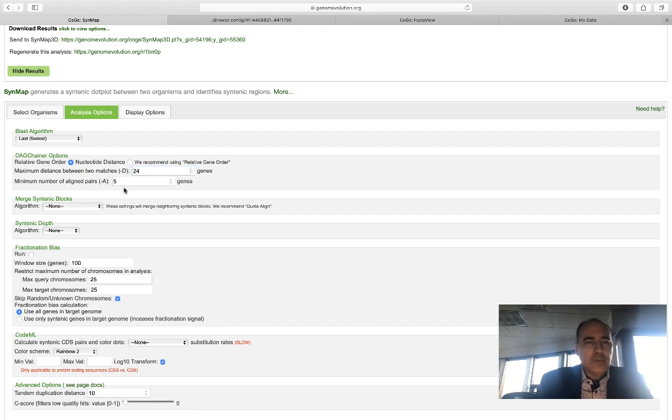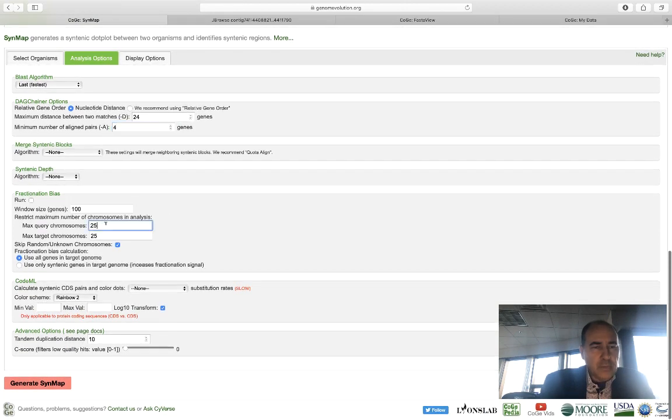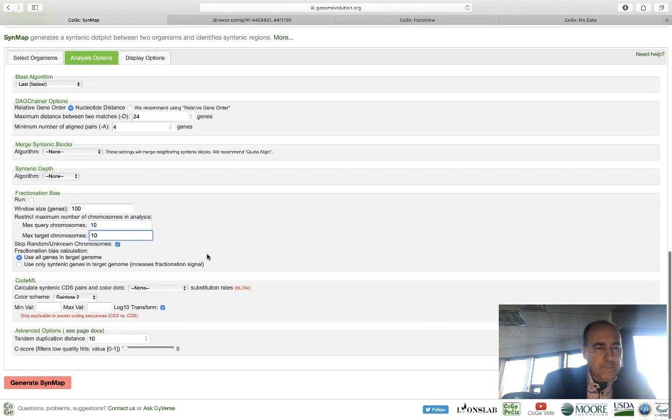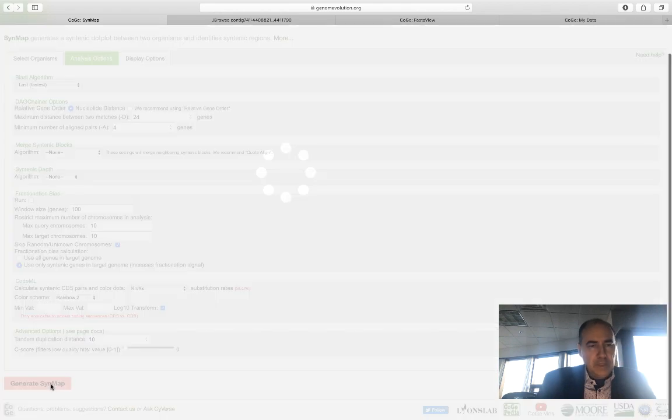If you want this at 24 and 4, and I think the most important feature, tell the chromosomes are 10. Let's do some KnKs. That's always fun. Let's give that a shot.